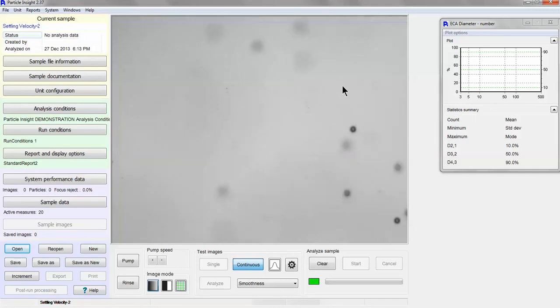Obviously in this case it may not be optimal because we have some very large bubbles that might be going up, and some particles flowing their way down and disrupting things. But if we get to a point that we have a good number of particles, we can go in and look at the particle velocity. In this case, once again, not very appropriate. These polystyrene latexes tend to flow up because they're somewhat buoyant. But if we had some particles that were very heavy, we would see how those particles would flow down. Let's say possibly with that one, if we were in better focus, we could probably capture the information just on that one.